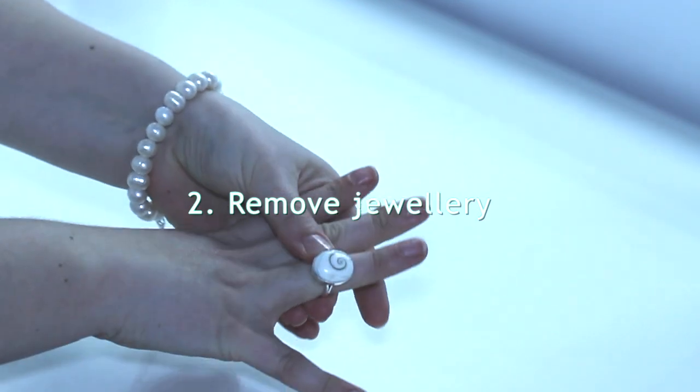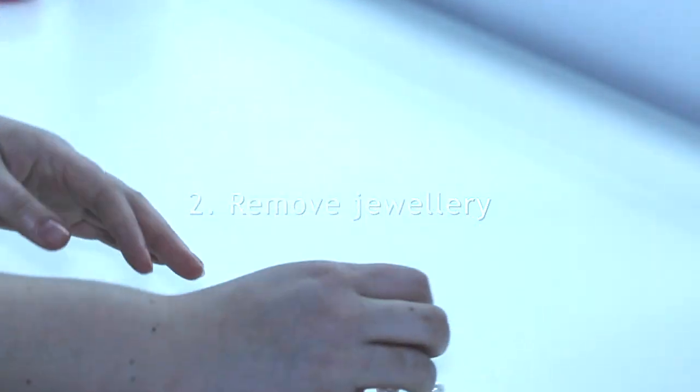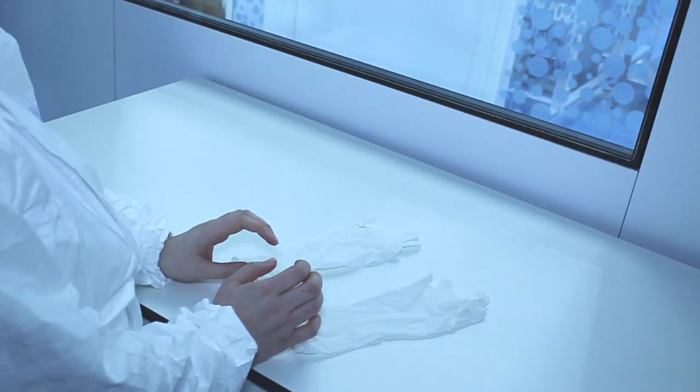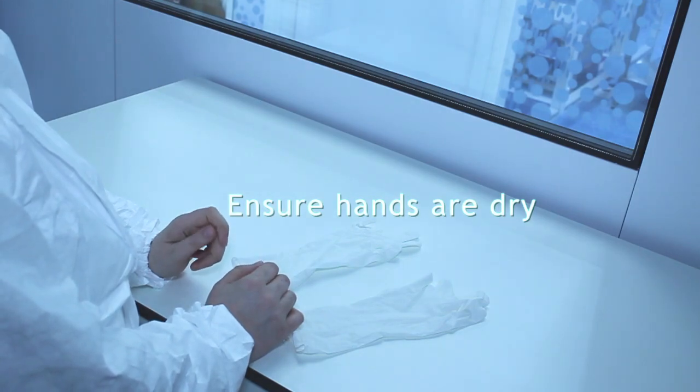Remove watches or jewellery. For sentimental items you wish to keep on, such as wedding rings, completely covered with tape. Wash hands with a mild soap and dry your hands without being abrasive, preferably before entering the change area.